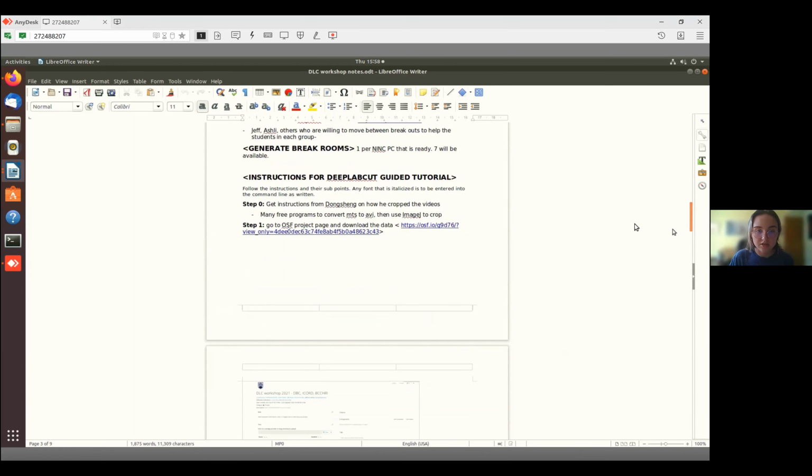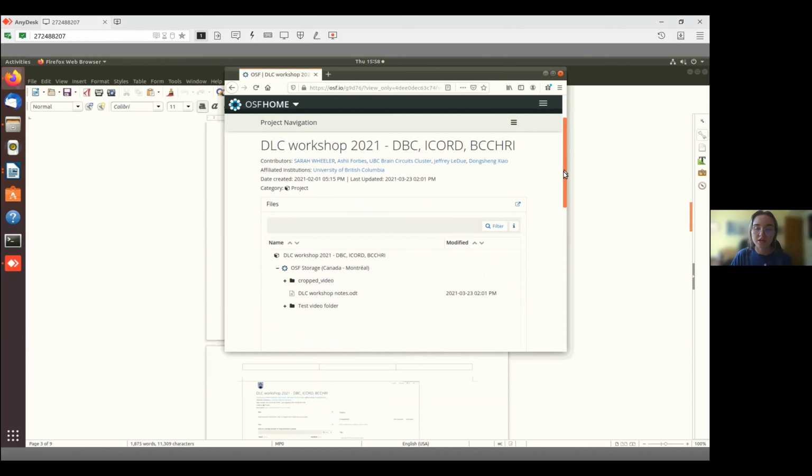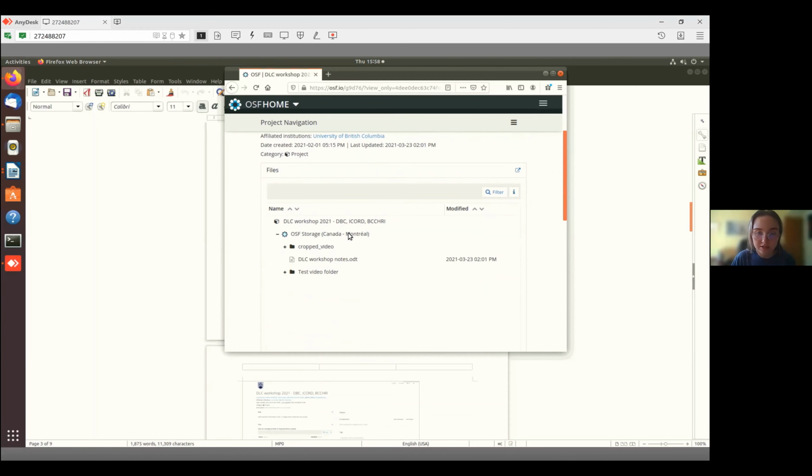So step 1 is to go to this OSF page. The link is provided for you. I already have it up over here. Then I'm going to scroll down. This is the data that Sarah Wheeler has kindly provided us.